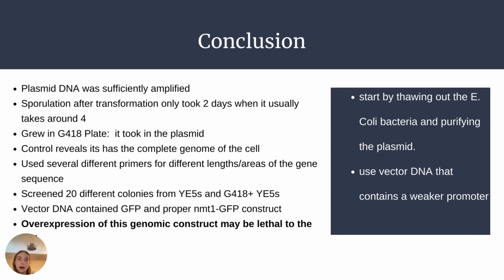The implication of this research is that potentially the overexpression of an ion channel gene encoding protein could result in cancers and other diseases caused by insufficient cytokinesis. Unfortunately, I did not get to the microscopy step of this experiment because there was a lack of fluorescence expressed by this cell protein.